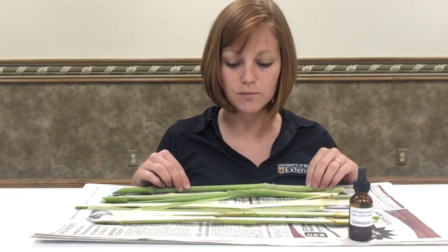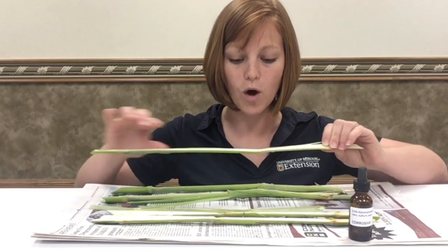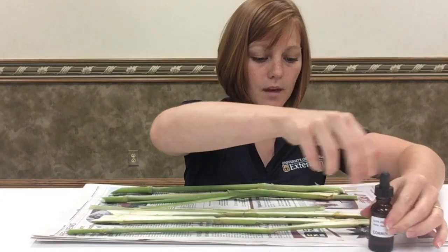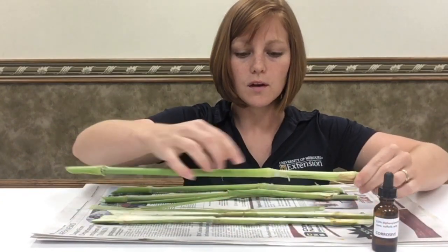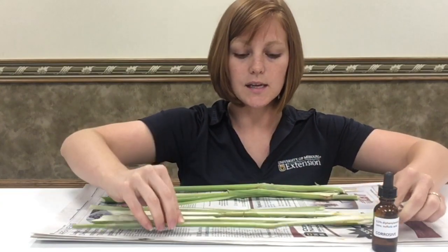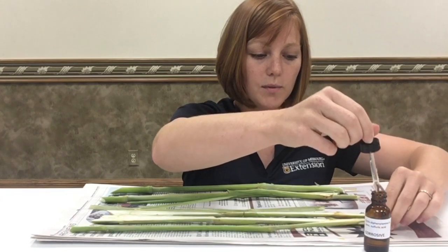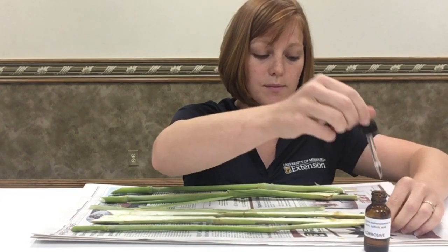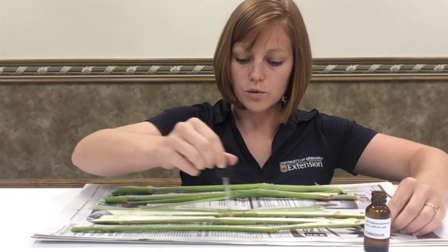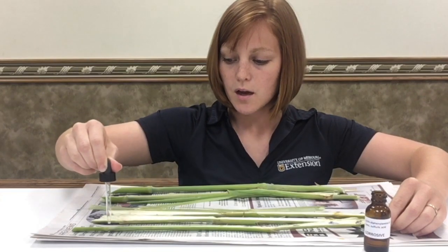So you can see here I have some sorghum sudan grass. I've already got it cut in half lengthwise and I'm just going to take the solution and drop it along the nodes, which are here along the stem, and along the inside of the stem. You'll want to do it on the inside because leaves don't tend to accumulate nitrate as much. That's why it's important to do it along the stem and along the nodes — the nodes tend to be a place where nitrates really accumulate.